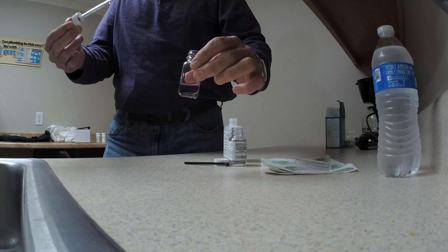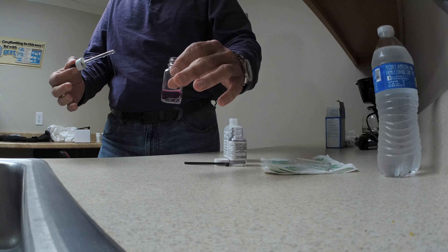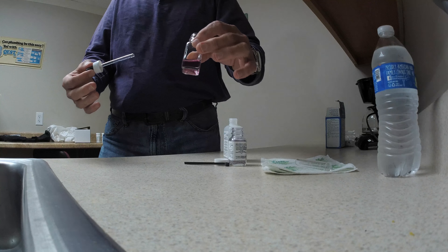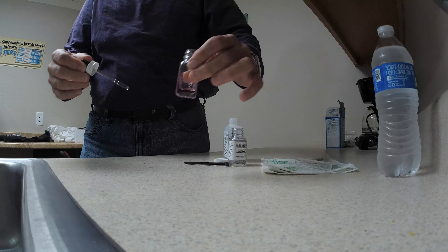By the standards of the industry, anything 3.5 or higher is considered hard water. So this is a great opportunity to talk to our customers about filtration systems. Put one more drop in there and you can really see how blue it gets.